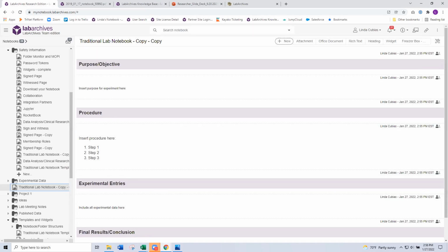Okay, so that was a quick tour, an introduction to using LabArchives to manage your research data. A bunch of questions. So I'm going to start going through our questions. Now, I also realize we've got about 4 minutes left. I'm happy to stay on until we can get through all these questions. Some of you may have to leave.